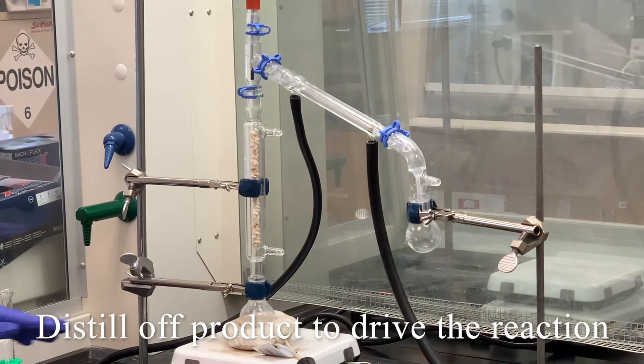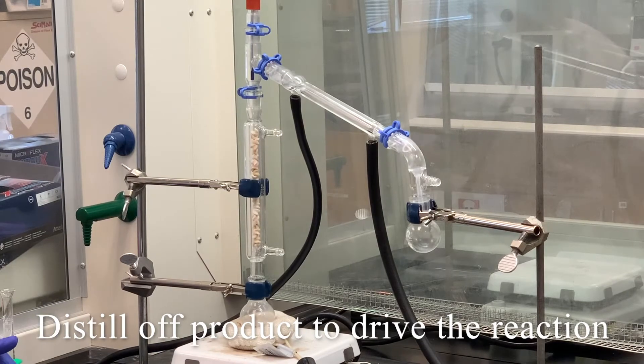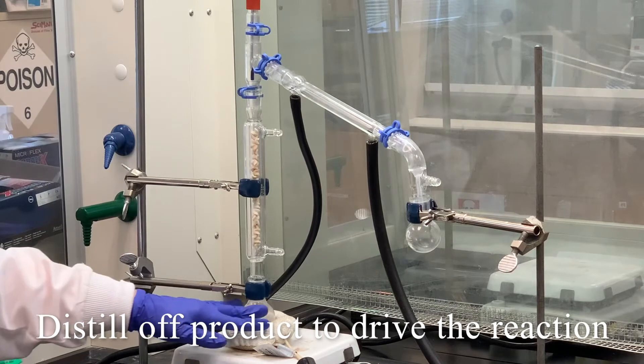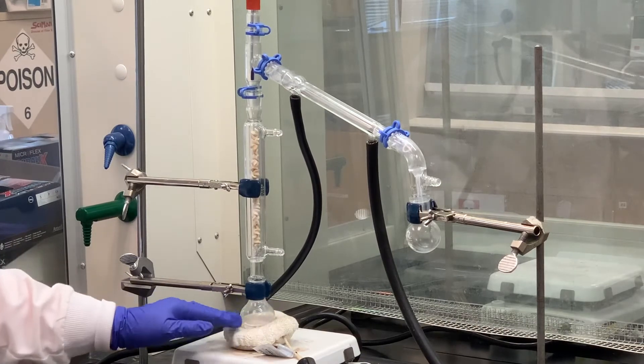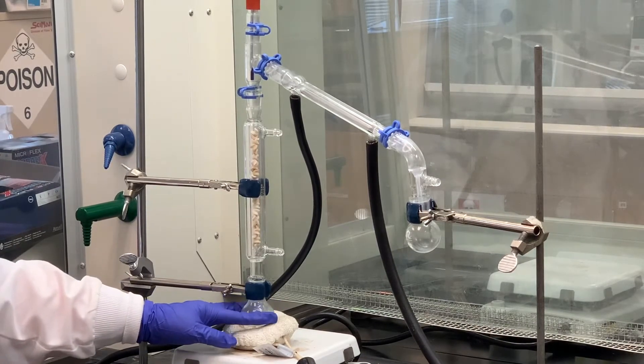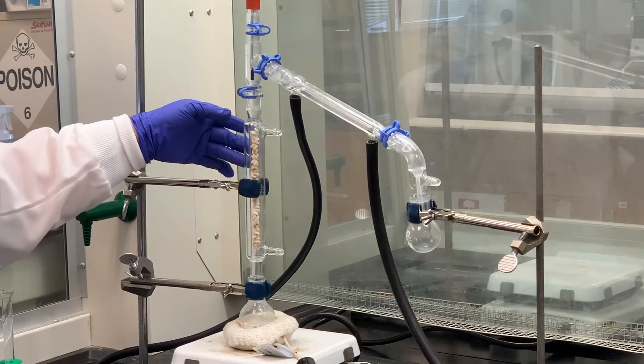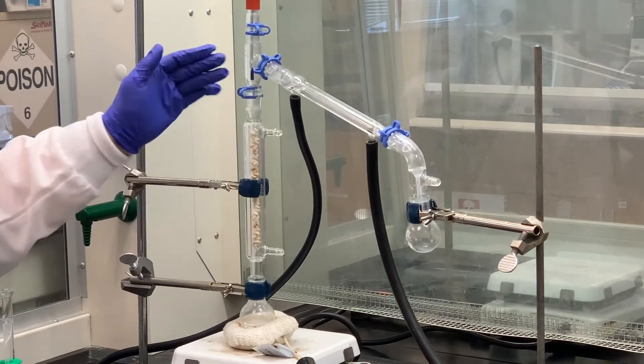So one way that we can make that reaction go more to the right, if it is an equilibrium, is to distill off our cyclohexene when it forms. So we're using a fractional distillation. We're going to start heating this. And I will say that it's important not to heat it on high initially. We know it takes a while for this to go up through the fractionating column and then down the condensing column.